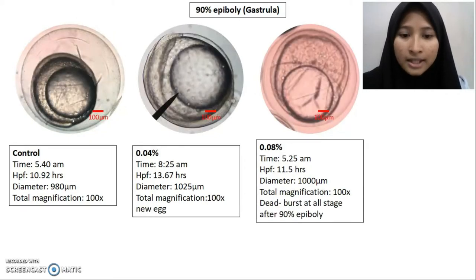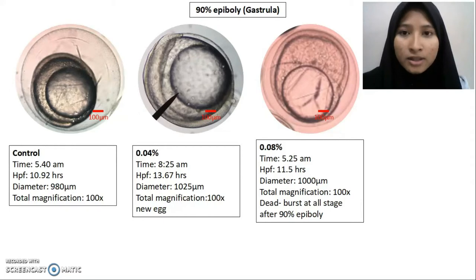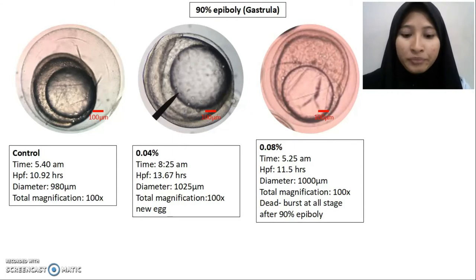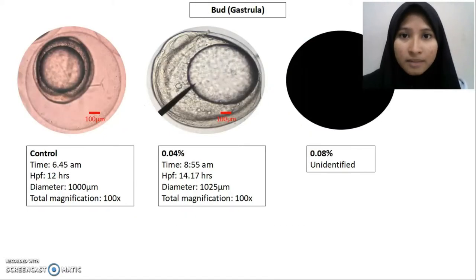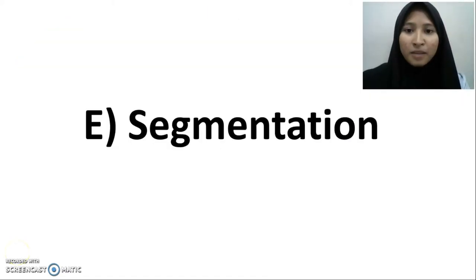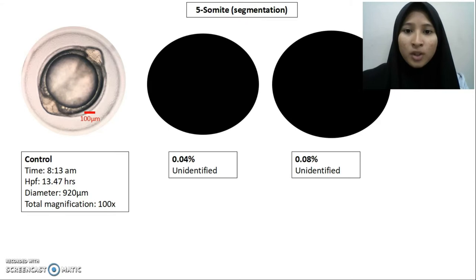At 90% epiboly stage, the 0.08% treatment eggs started to burst and die, making them unable to survive to further stages. This was the last stage of observation for the 0.08% concentration. The gastrula period ended with the bud stage. At the segmentation period, there were no changes in age for each stage. For the 5-somite stage, only the control was observed and it shows the top view of the egg.